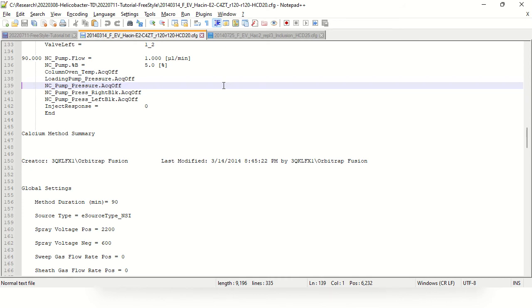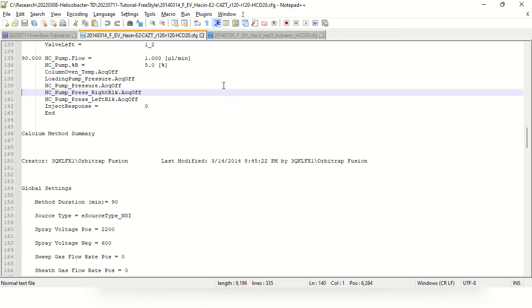Naturally, Thermo Raw Meta Dump is useful on instruments made by Thermo, but it is not useful on instruments made by Bruker or SCIEX or Agilent. So you're not going to be able to use this tool there. We do not necessarily have tools that allow us to extract methods in the same way from those other experiment types. All right, so we're going to drop down through here.